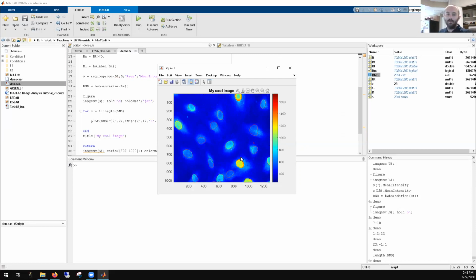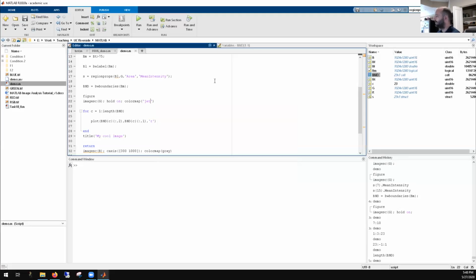Now, sometimes it's good to have these kind of high contrast transitions between relatively close values, because it can help you accentuate important parts of the image. But if you're just trying to look at an image and understand it, grayscale gets you a linear brightness increase for a linear increase in intensity, or index.